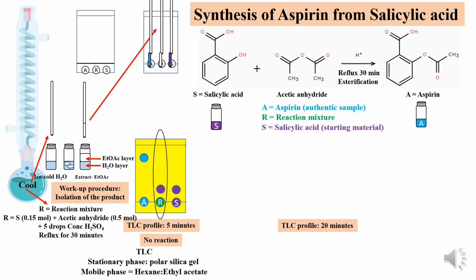Now let's check the TLC profile after a period of 20 minutes. And now we see that a new spot has appeared in the TLC plate. And this may possibly be our desired product, aspirin. In the reaction mixture, as per the TLC profile checked after 20 minutes, we find two spots.